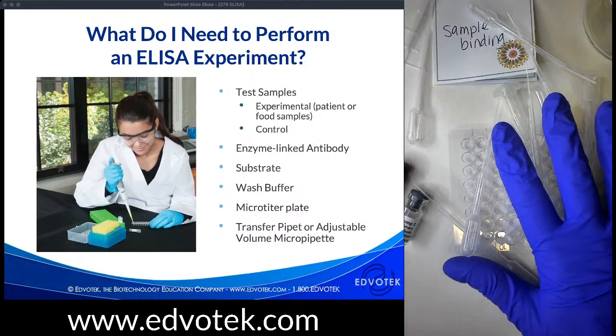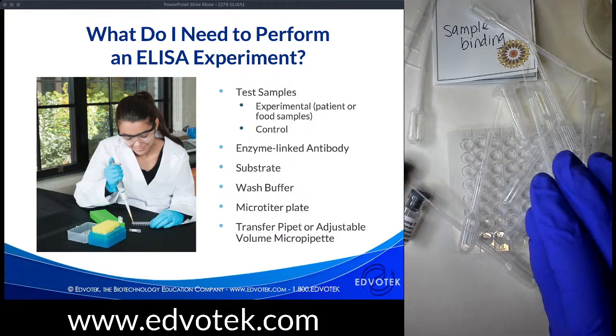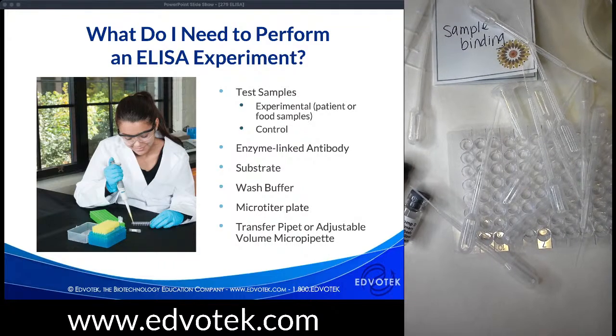Our experimental samples differ based on the test. For many medical tests, it could be blood, urine, or saliva from the patient. For food tests, this could either be raw materials or the final product itself. We don't know how they're going to turn out, whether they'll be positive or negative. So maybe you do, if you were paying attention a few slides ago, I did have the picture. But we're going to go through pretending that we do not know which sample is which.